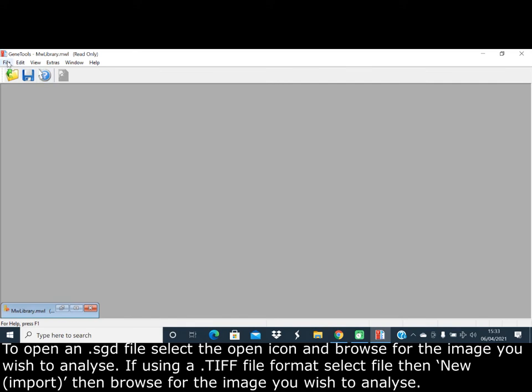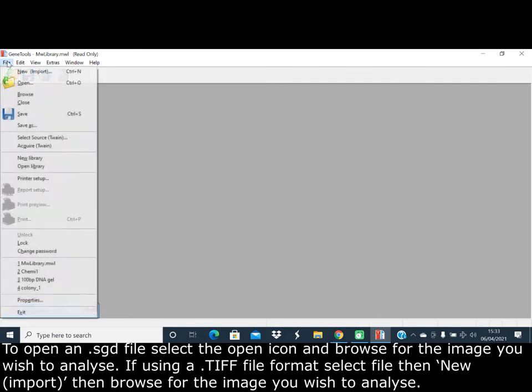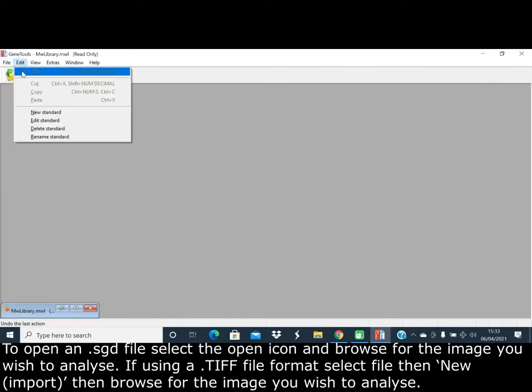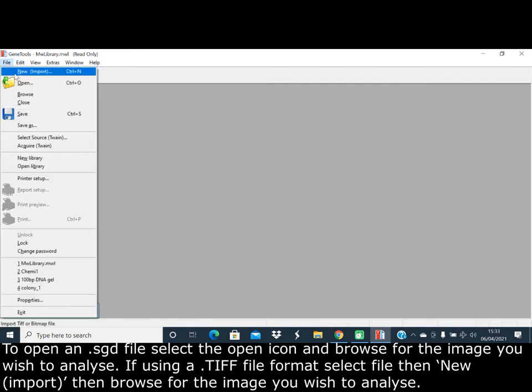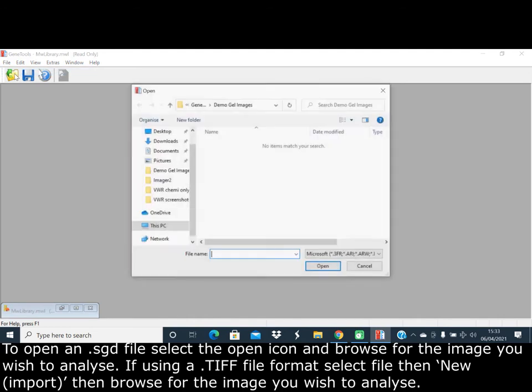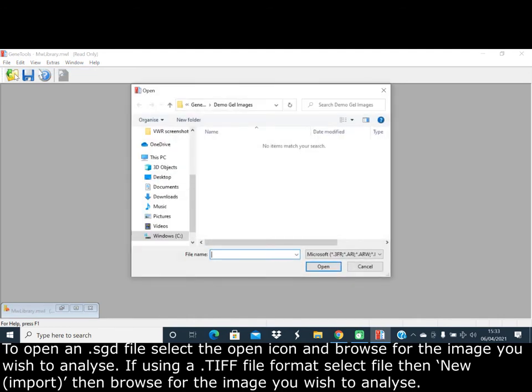If using a TIFF file format, select File, then New, then Import, then browse for the image you wish to analyze.